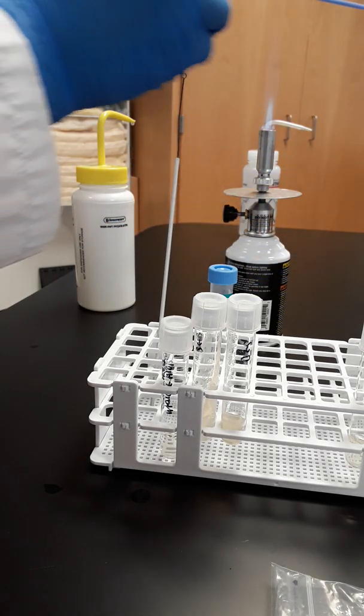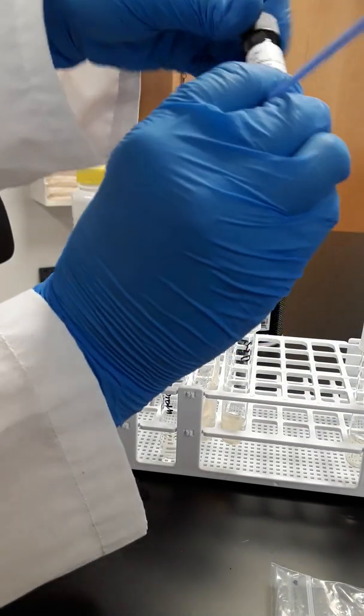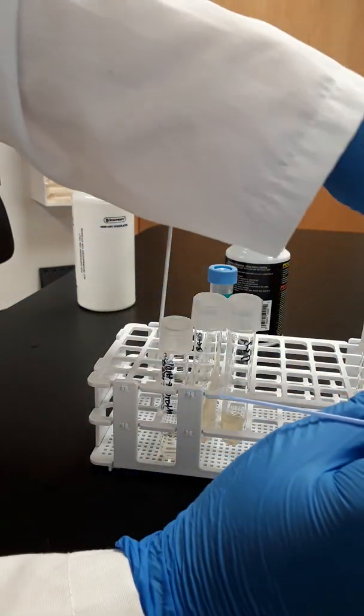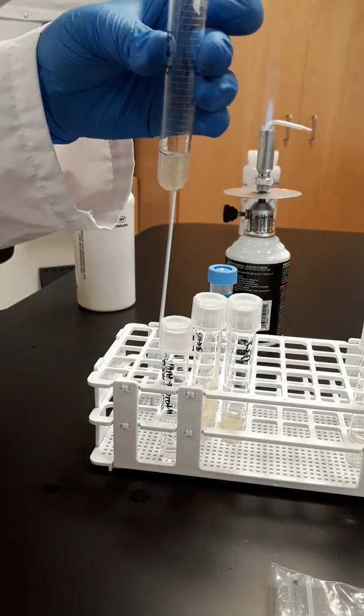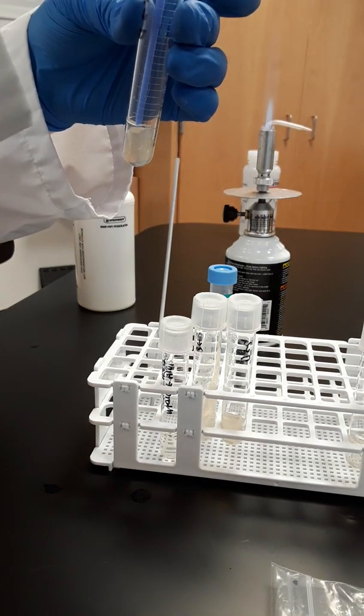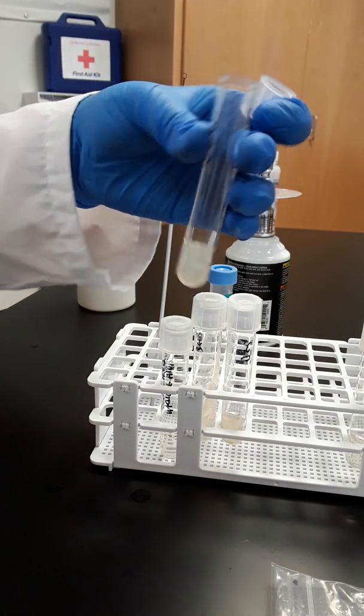And then you're going to flame, flame, flame, flame. You're going to take this and just dip it straight in, and then, I don't want to contaminate my culture. Sorry, guys. And then, because it's a little bit easier, as soon as it's touched the liquid, it's got the cell on it, and then you just stab it straight in.